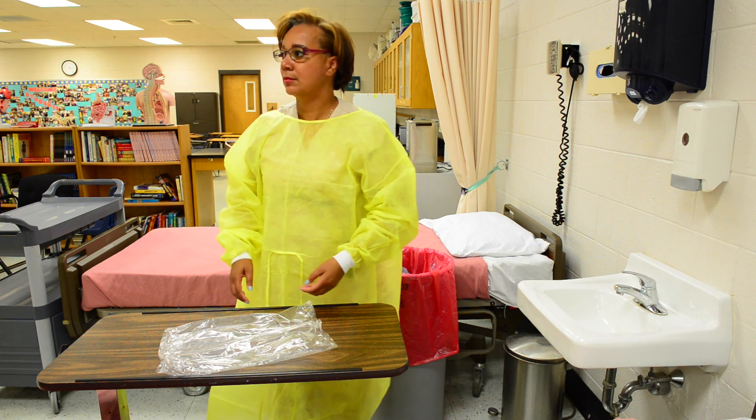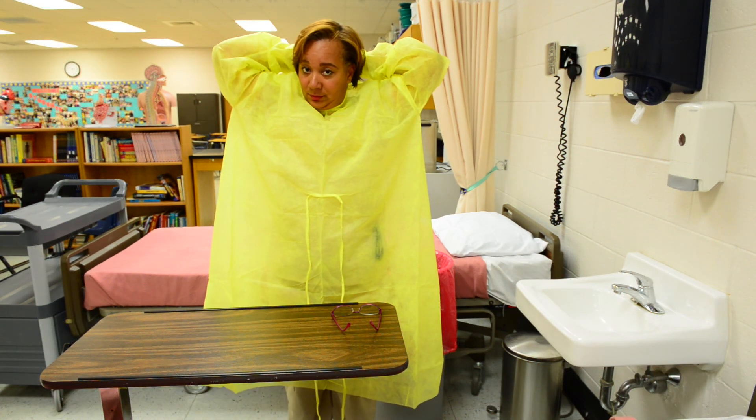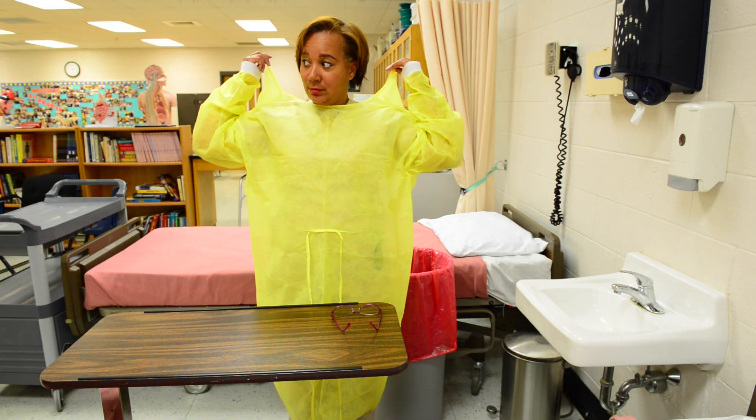Lastly, take off your safety glasses. Remove gown last. Untie neck ties.